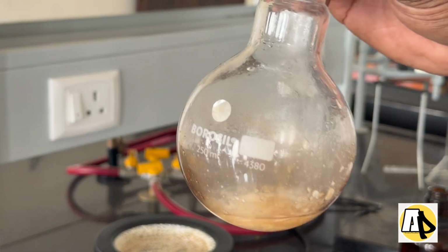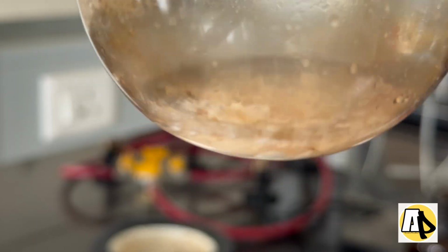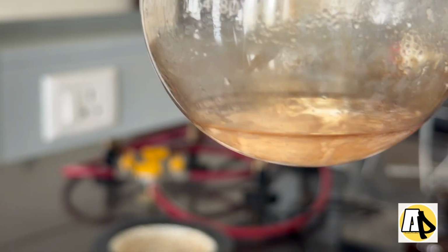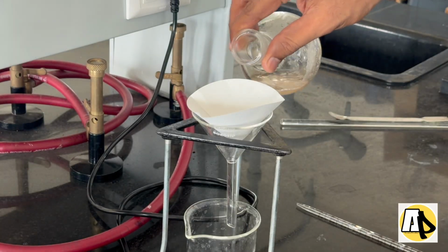As you can see now, the solid precipitate that is formed in the RBF is not getting solubilized even after shaking. So we have confirmed the formation of salicylic acid. Now we have to filter this and then I will show you the next step. Now we are going to filter this salicylic acid.